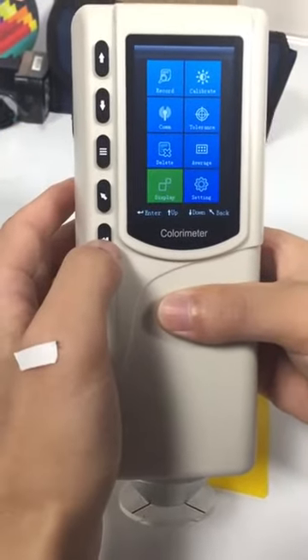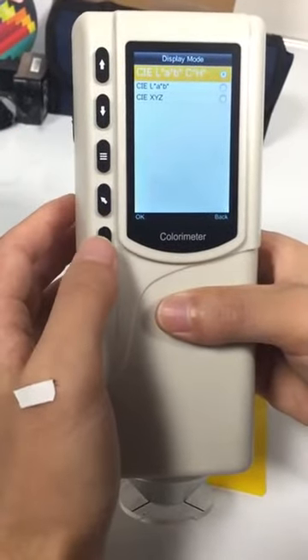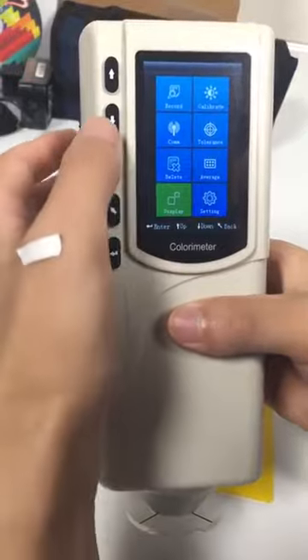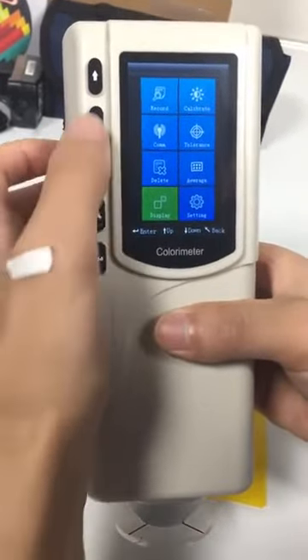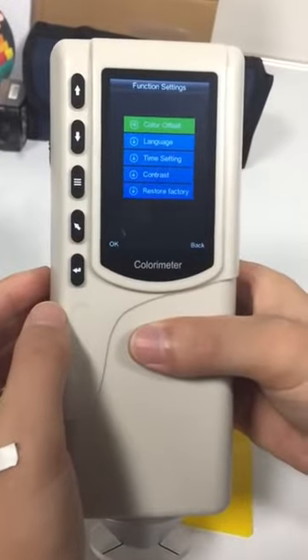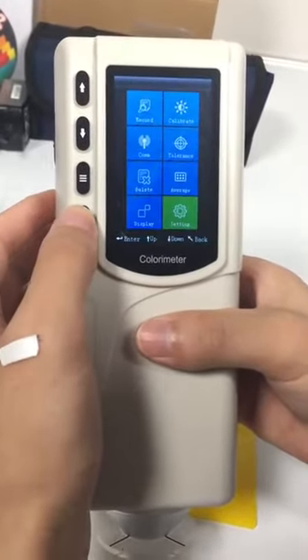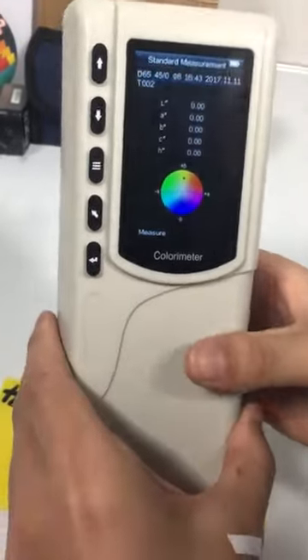Display — you can choose LAB or RCH here. Settings — general system settings here. Okay, that's all. Thank you for your attention.